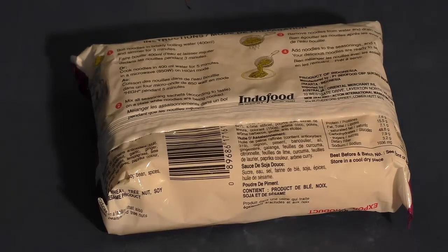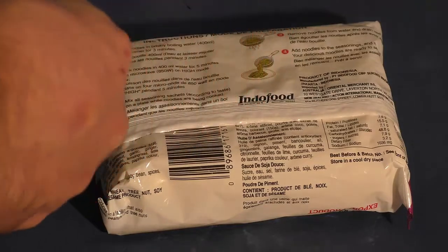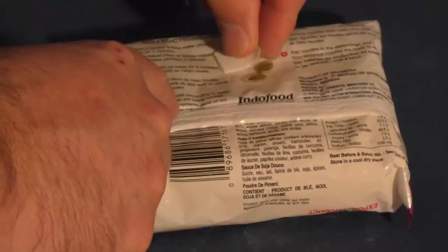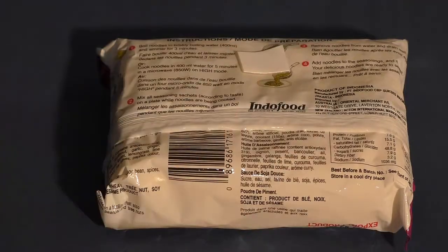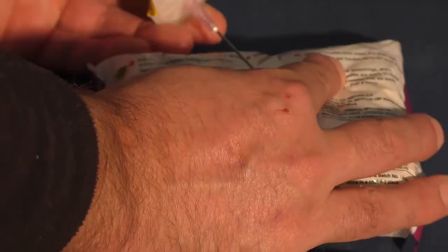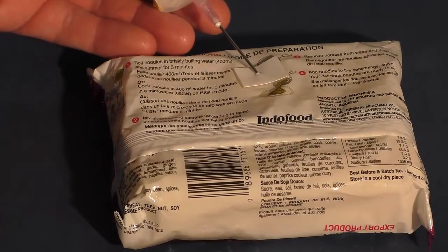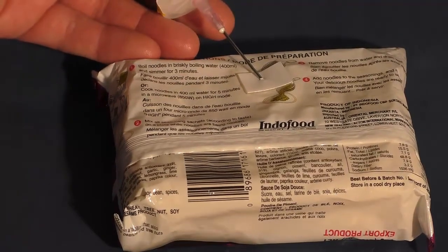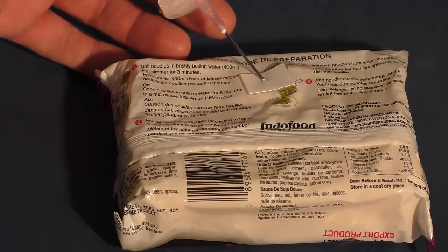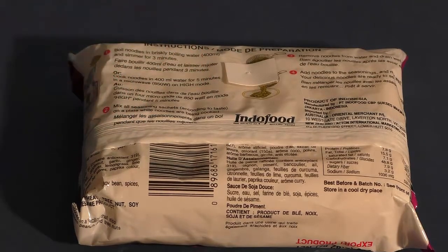The recommended method for sampling gas inside the headspace of a package is to take a piece of sample septum tape, stick it on the package where you plan to take the sample, take the needle with the pointy side down and insert it into the packaging in one clean motion, then wait while it sucks the headspace through the analyzer. Once you've finished sampling, you can remove the septum tape and take it with you to the next package.